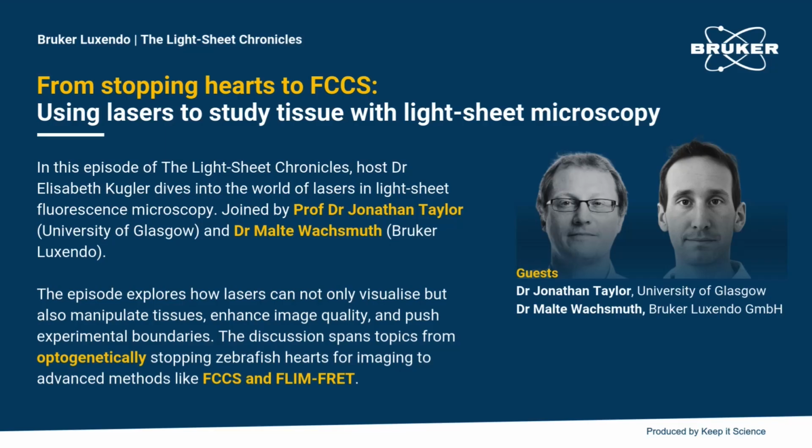Yeah, and I think it's also important to note that the zebrafish that you presented in that study have a very rapid heartbeat, right? Around 120 to 180 beats per minute. So the whole system and all the computation needs to be very rapid, right? Yeah, we're having to track the rhythm of the heart over time, because it wouldn't be enough just to assume that the heart is beating at a constant steady rate. So we're having to process images at about 100 frames a second, make real-time decisions from those, and then determine when the correct time will be to capture the next image.